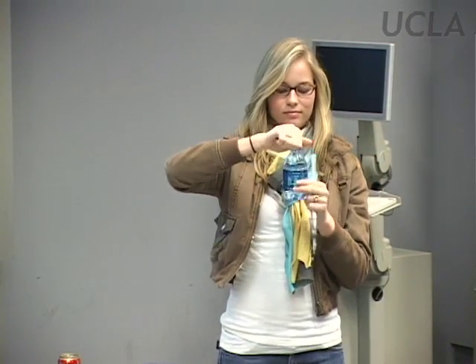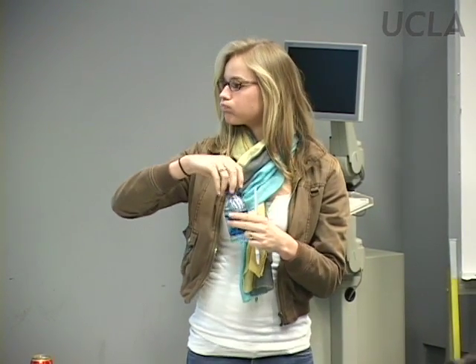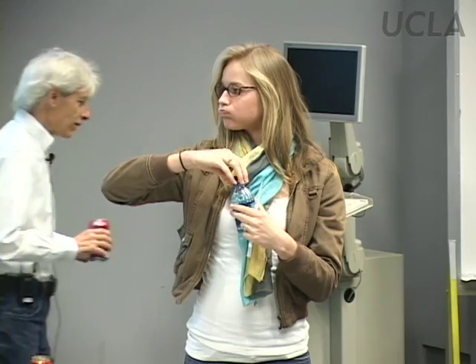And just open your water and just rinse out your mouth for like 10 seconds. Rinse all that junk out of your mouth that you've been munching on. We want a pure sample of just your cells, and not your lunch, your boyfriend and girlfriend's saliva, so we don't get a mix here. Okay, so just for like 10 seconds. Swirl it around.